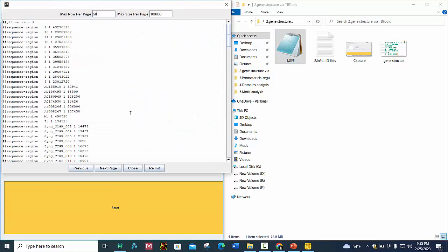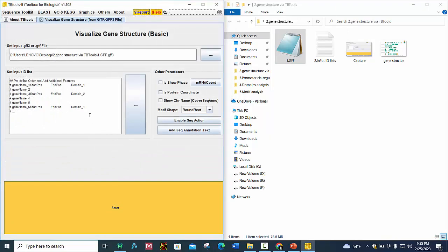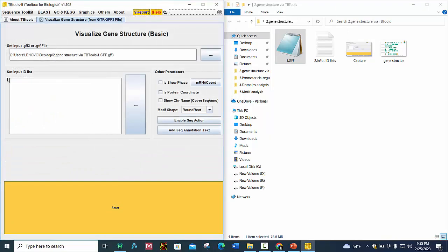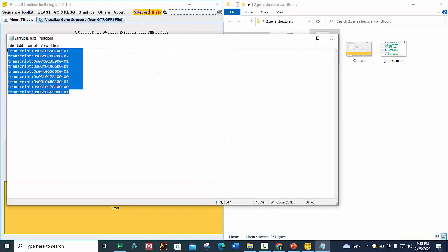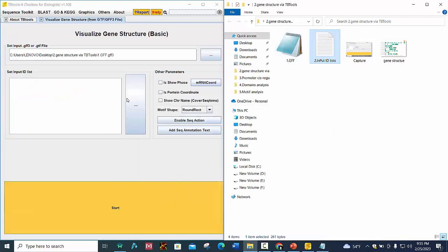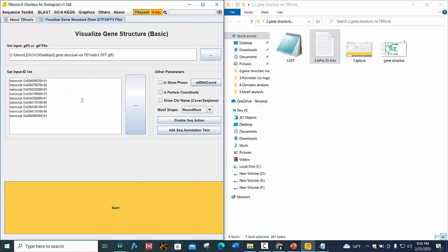GFF file, and then enter your input ID list. Here are our input ID list, copy it and paste it here, and press Start.